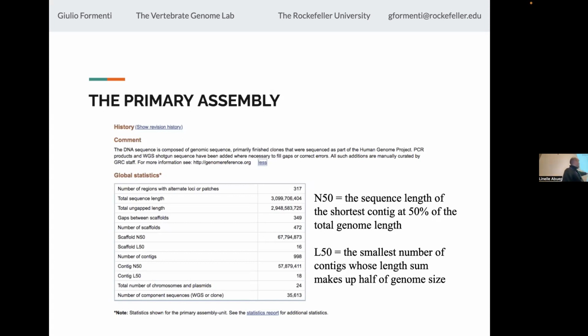And then we have these two magic numbers that, when you're dealing with genome assembly, people often look at: N50 and L50. There is one for scaffolds and one for contigs. Just as a reference, as Olivier was showing before, the primary difference between contigs and scaffolds is that a contig means a sequence uninterrupted with no gaps in it. When you start to have gaps, because for whatever reason you didn't sequence that region and you don't know exactly how to reconstruct its sequence, you place a gap in it. It's a run or stretch of Ns, usually, in the sequence.